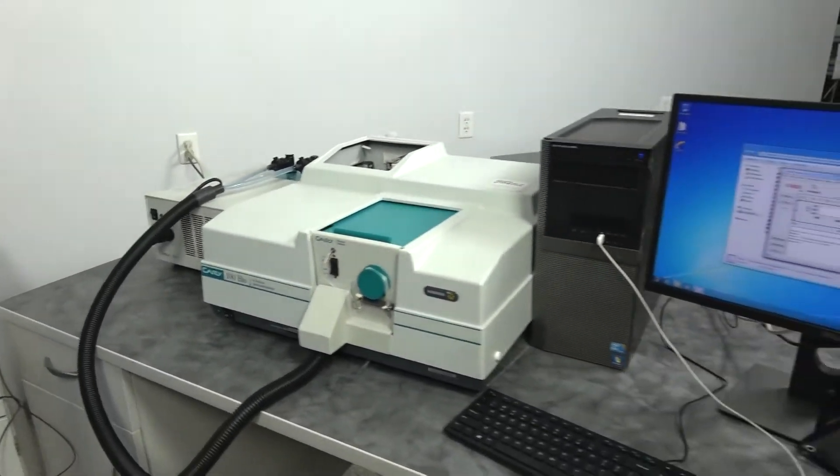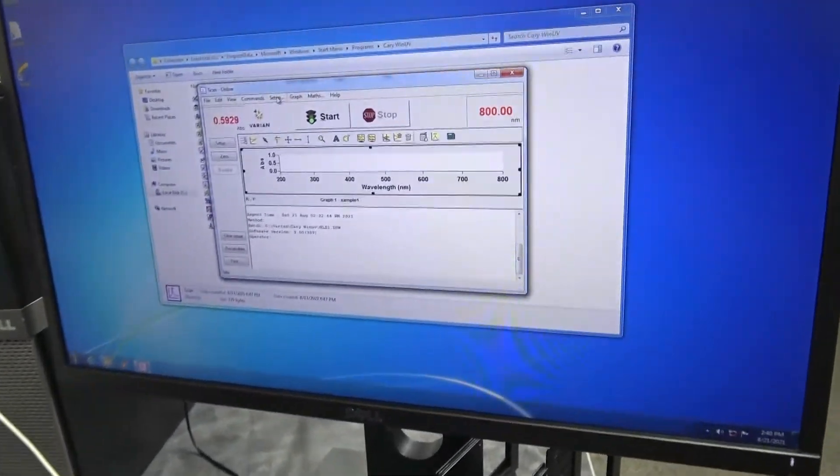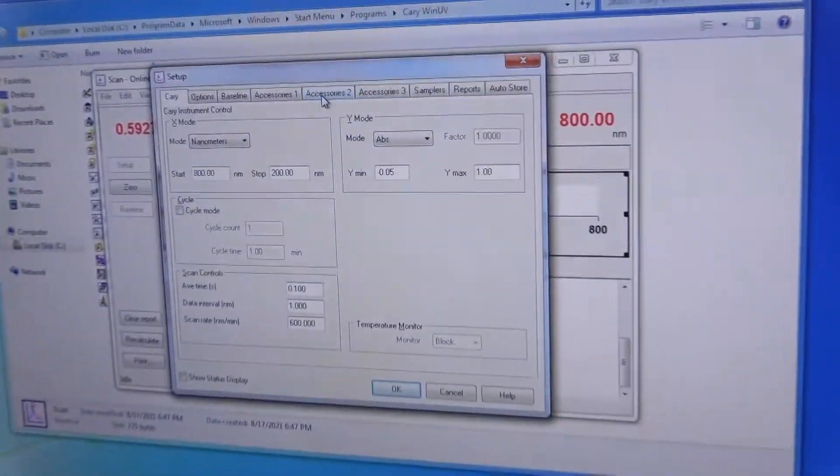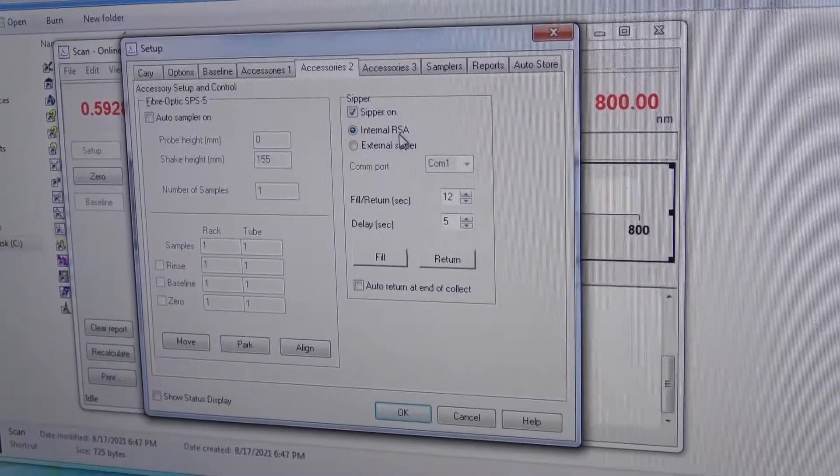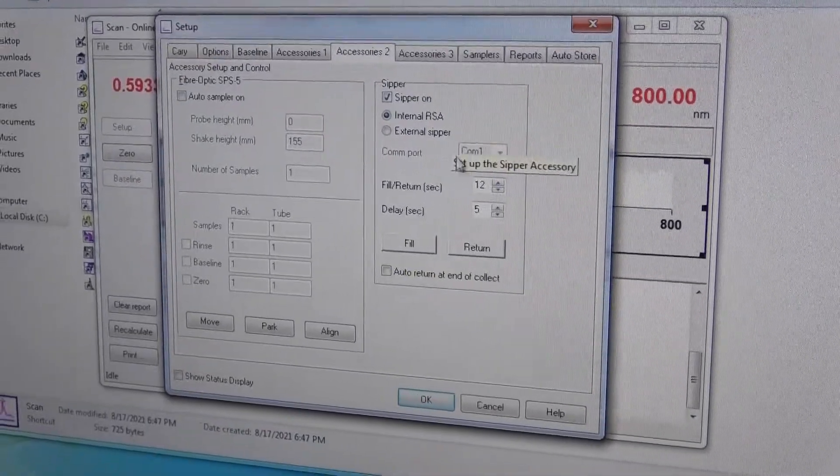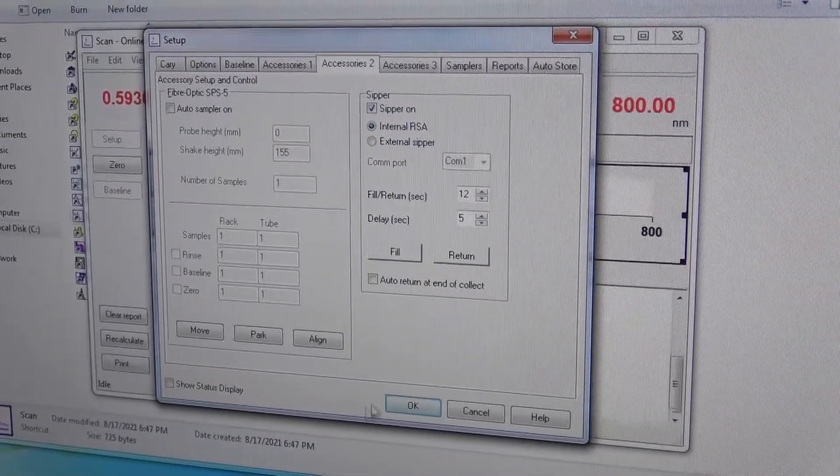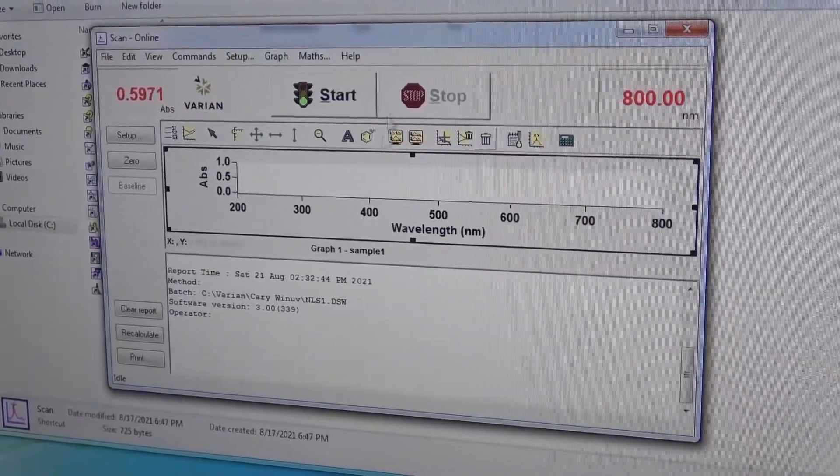Software is controlled much the same way. You go into the setup, accessory 2 in this case. That's your sipper models. This is an internal routine sampler. Sipper is on. You can set your delay and the like. Click OK. Now when you run your sample.